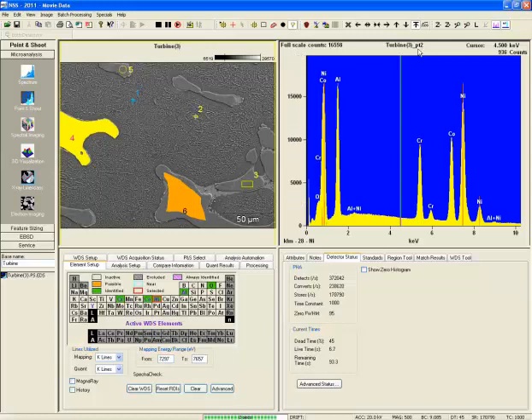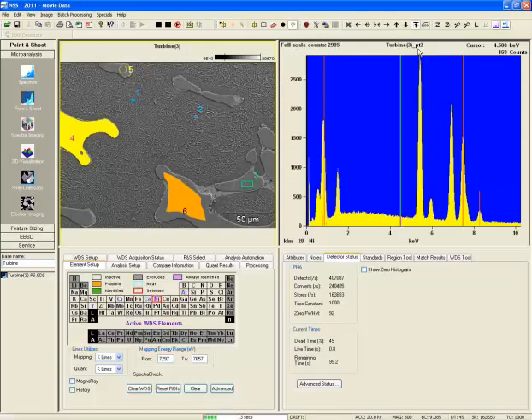It is now labeled as turbine data set number 3, point number 2. Once it acquires, it moves on to the next data point, and now it is point or area number 3, and it will cycle through. So in this way, it is automated acquisitions that the user does not have to stay here and monitor completely, but they can move on to a separate task somewhere else, let this acquire, and then come back when all the acquisitions have completed.